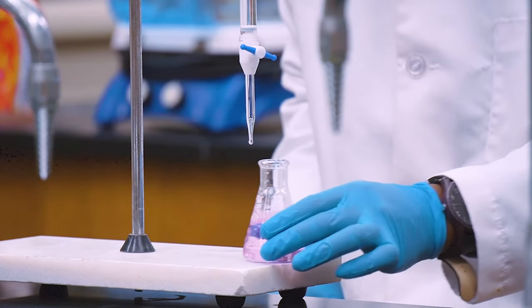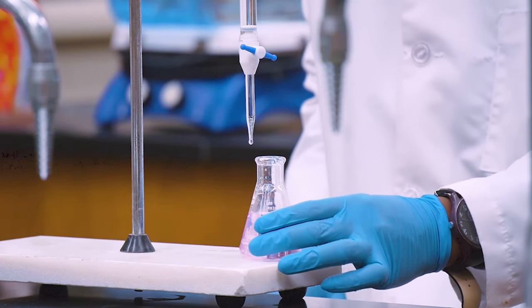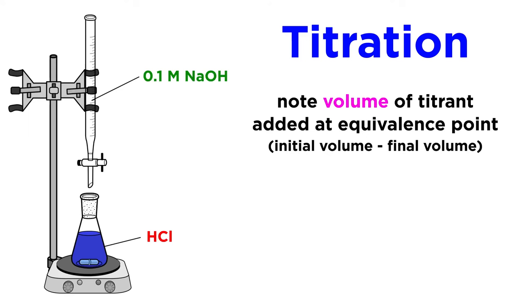As you can see, this pink color is not changing anymore, so we are at the equivalence point. Record the final volume reading on the burette and get the difference from the first reading.